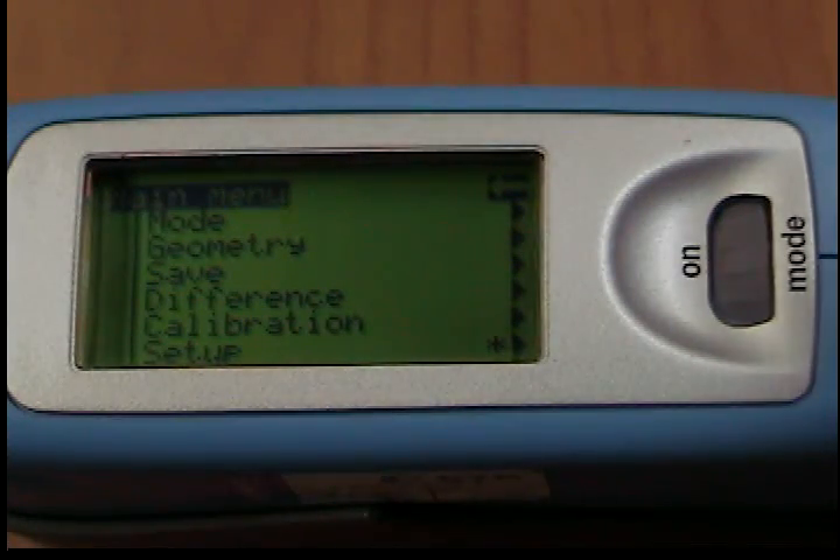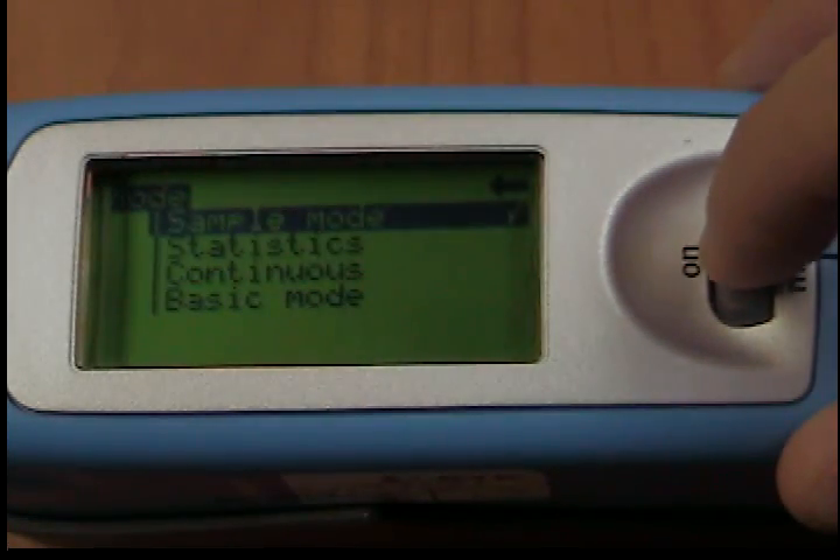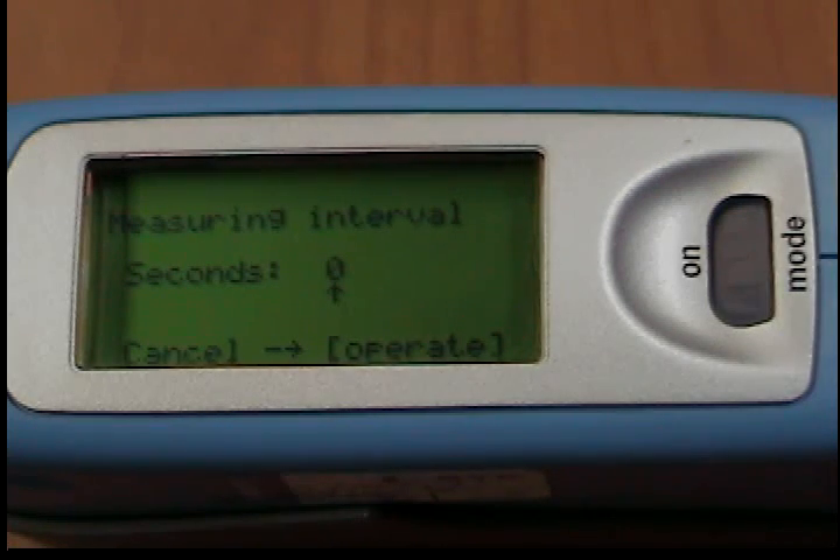Using the continuous function on your micro tri-gloss gloss meter, you can use this function to perform up to 99 measurements at an adjustable measurement interval. This is helpful when you are covering large samples and you want to evaluate the homogeneity of the surface.